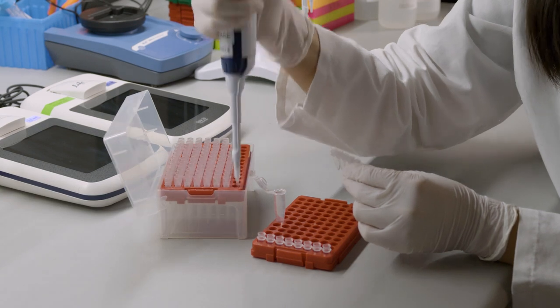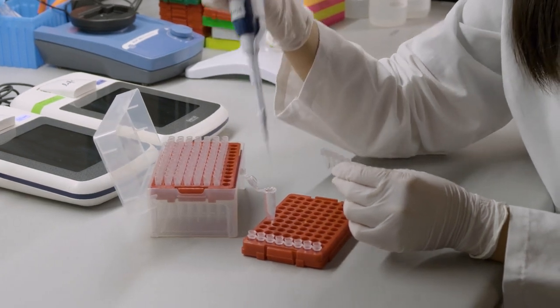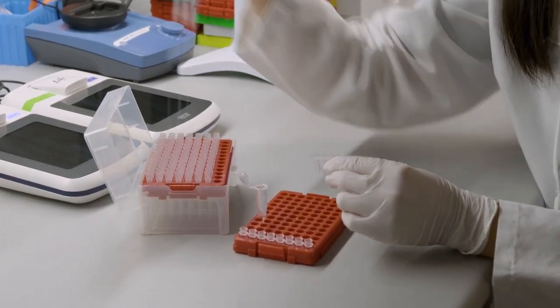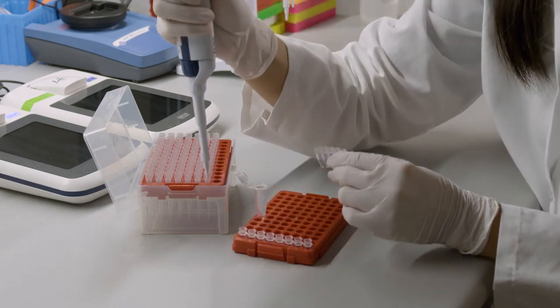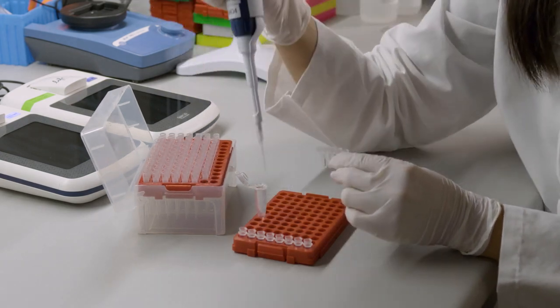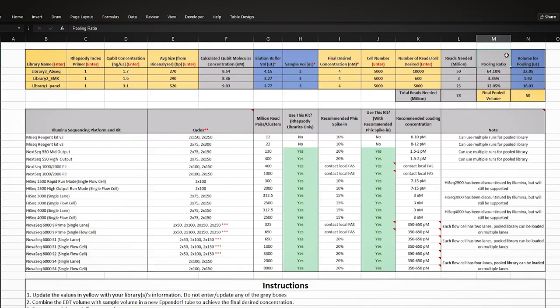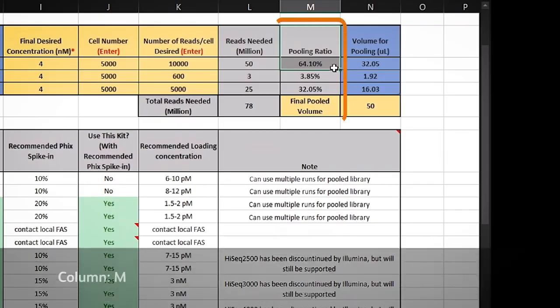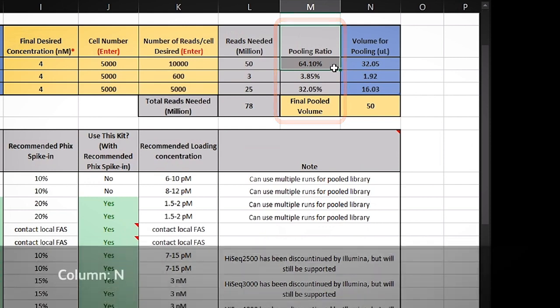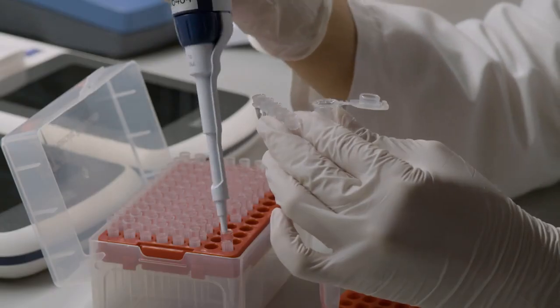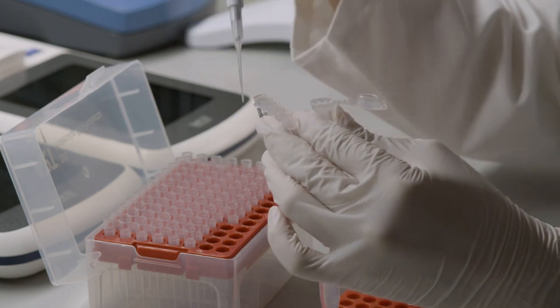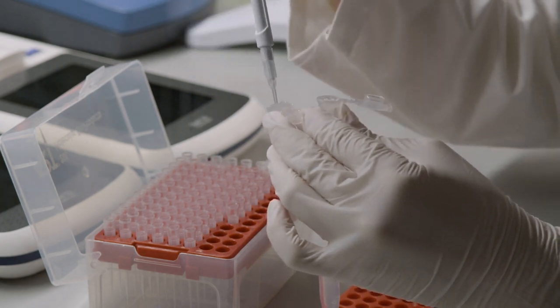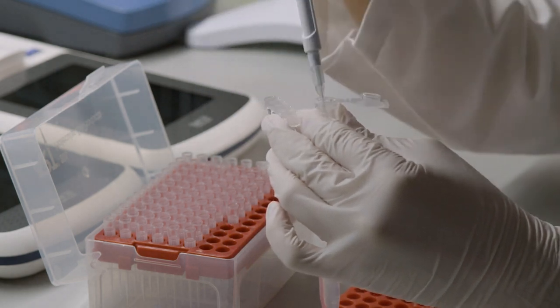Now that the calculations are complete, and keeping in mind any requirements from the sequencing facility, dilute the libraries to the same molarity prior to pooling. Based on the number of reads assigned to the various libraries, the pooling ratio will be calculated in column M and the volume of each diluted library to pool in column N. Based on this pooling ratio, take aliquots from individual diluted libraries to make the BD Rhapsody system library pool.